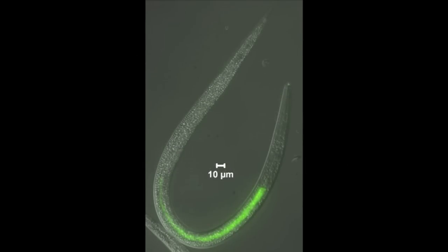First we will go over some nematode anatomy. We have the posterior, or the tail, and the anterior, or the head. We also have a pharynx, which is important for this video.